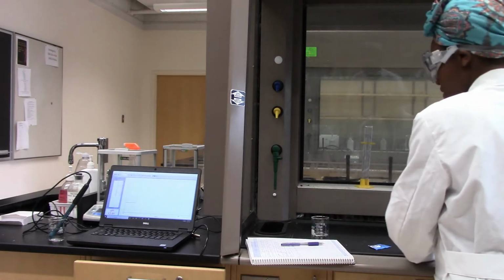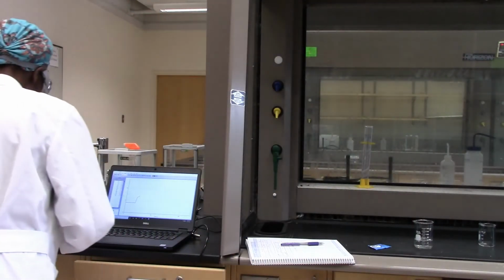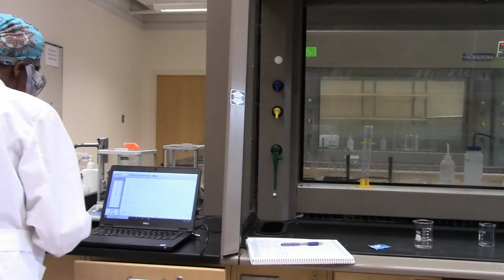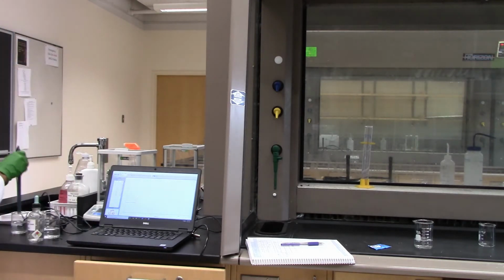Here we go, and I'll take the pH measurement of the solution first before adding any HCl or sodium hydroxide. But I have to rinse my pH meter and my pH probe, wipe it clean with a Kimwipe.